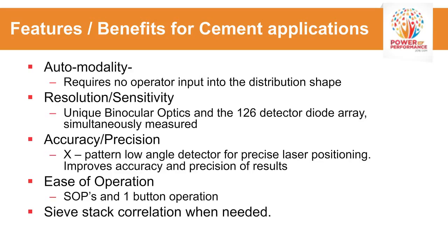Also available on the LS is for those that want to correlate back to screen sizes or mesh units. There's a sieve stack correlation you can use if you desire this capability. And so we can individually correlate to individual screen sizes, and you would select the screens that you use, and you can correlate the results, so the LS can give out the same type of correlation. Because laser diffraction instruments measure more of the volume of the particle, you're measuring the middle dimension of a particle. So you can correlate back to this size. You can apply a correlation factor in the instrument's output to correlate directly to screens that you use.